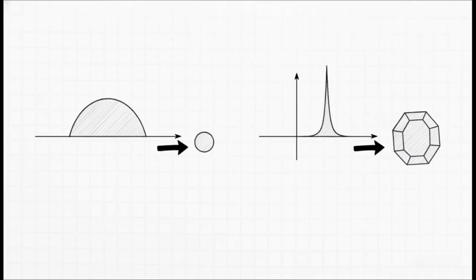Let's look at Debye-Scherrer first. D equals k lambda over beta cosine theta. Here, D is our mean crystallite size in nanometers. K is a shape factor, usually around 0.9. Lambda is our X-ray wavelength, and theta is that measured Bragg angle.